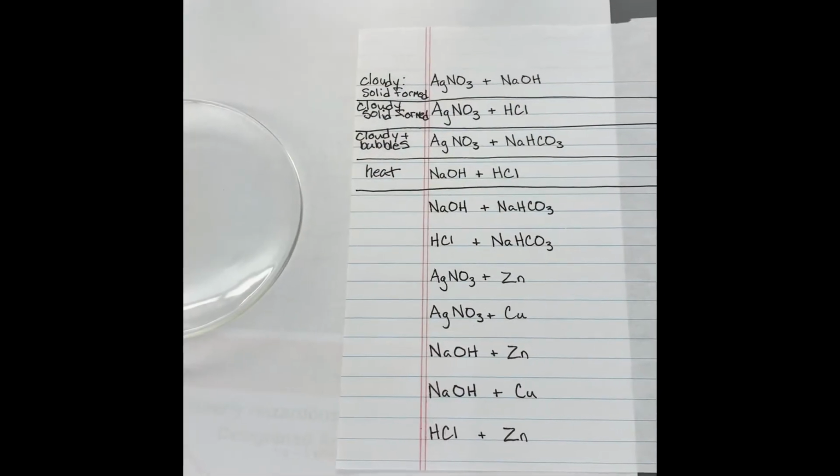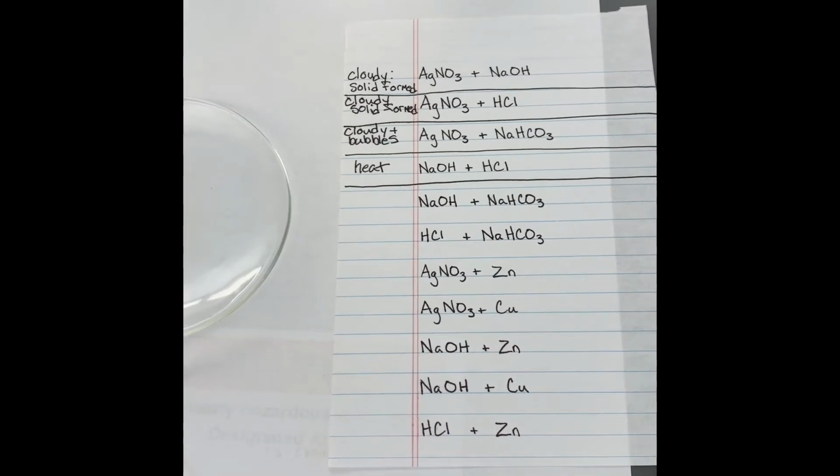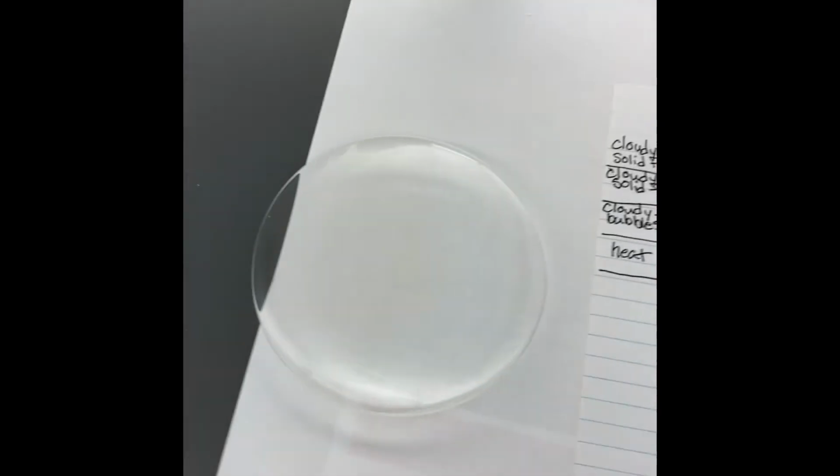Now let's look at sodium hydroxide, NaOH, and sodium bicarbonate, NaHCO3. Let's notice that these are both clear and colorless before we start.